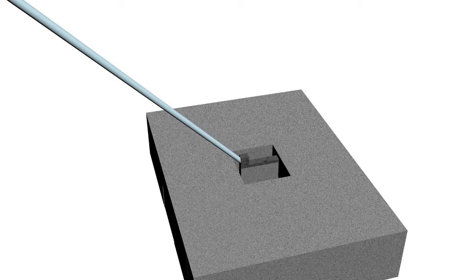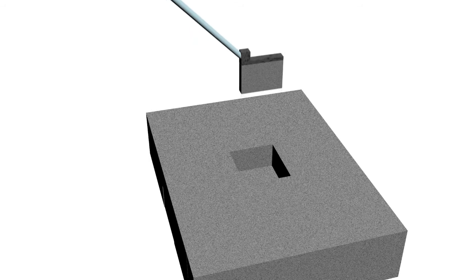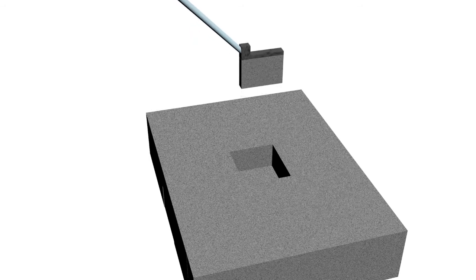Next, the ion beam is used to cut the lamella loose. Now, the lamella is carefully extracted from the hole using the omniprobe.